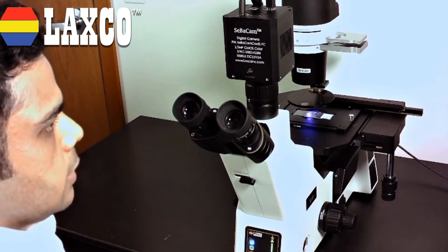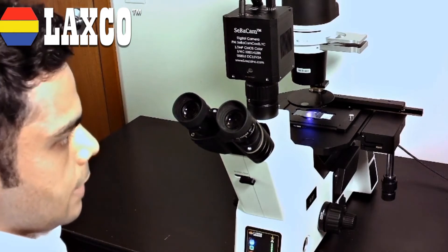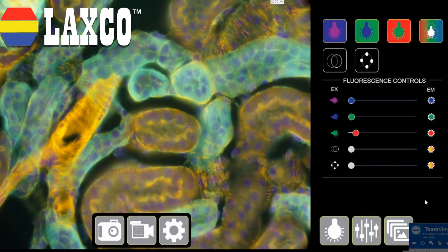Now let me switch over to the camera view so that I can show you some amazing images that this scope is able to produce. Here we have the kidney's fascinating structural complexity. This is a multi-channel live color image. I didn't have to go through 10 steps to achieve this result. I did not have to take black and white single channel images, superimpose them, add pseudo-coloring, and then get to this image. I just clicked a few buttons and I'm right here.